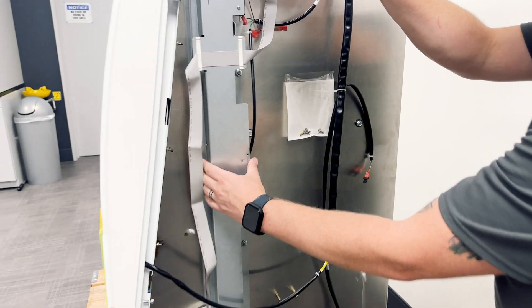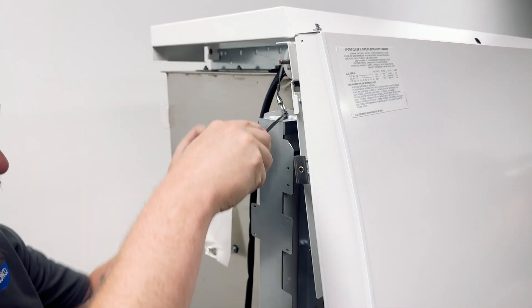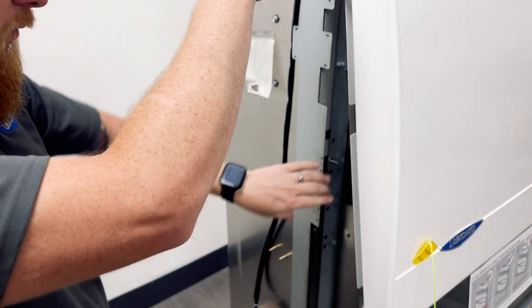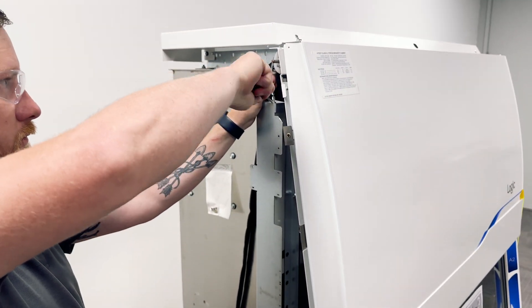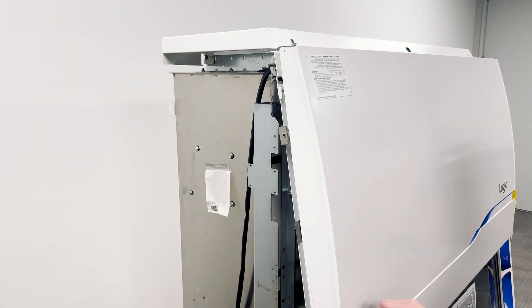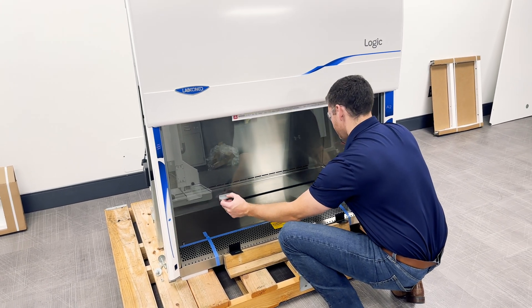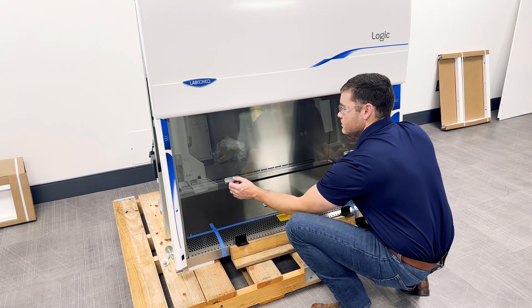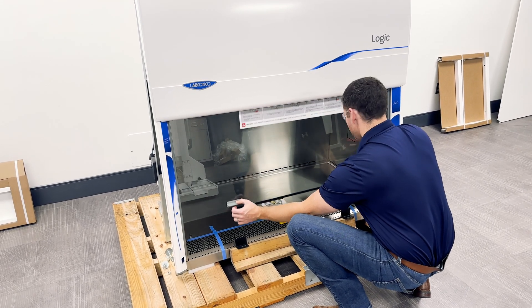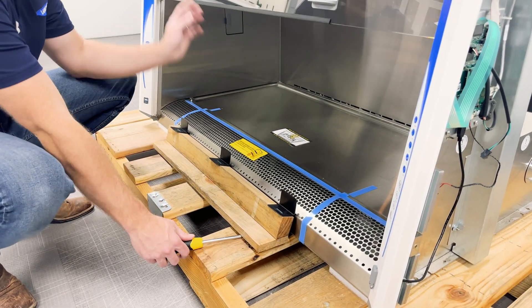Next, remove both sash pins. Locate each pin by following the yellow string from the front of the biosafety cabinet back to the side panels. Be sure to support the sash weights. Using a screwdriver, firmly pull both pins out to remove. Check the sash for smooth movement by raising and lowering it a few times.